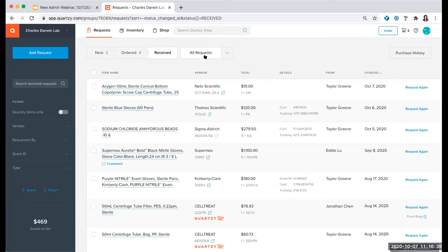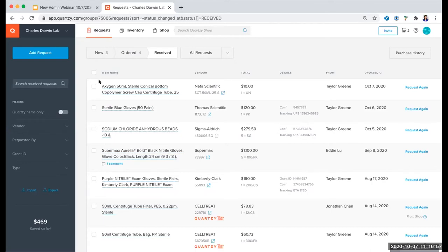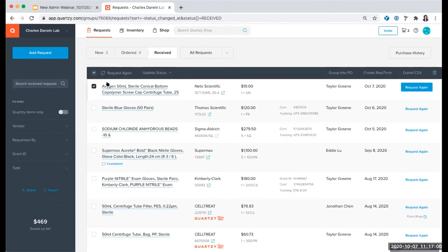You also have the All Requests status to see everything, or click the arrow to filter by multiple statuses at one time — that would include the other statuses not listed here, which would be Canceled and Backordered. You can click the checkbox next to an item and see all of the options in this top bar: Request Again, bulk update statuses, group under a PO number, create a requisition form, export to Excel or to a CSV file, and permanently delete some requests.